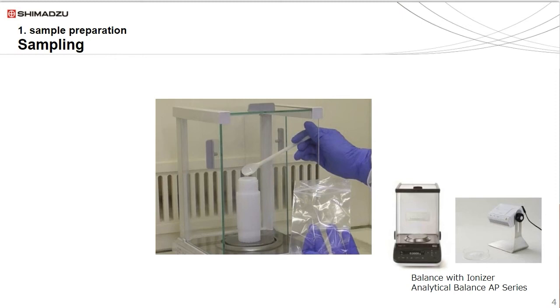Samples must be weighed accurately so that the end sample dilution is of known sample weight and in a known volume. This allows comparison between samples and standards, which are also prepared as weight to volume.